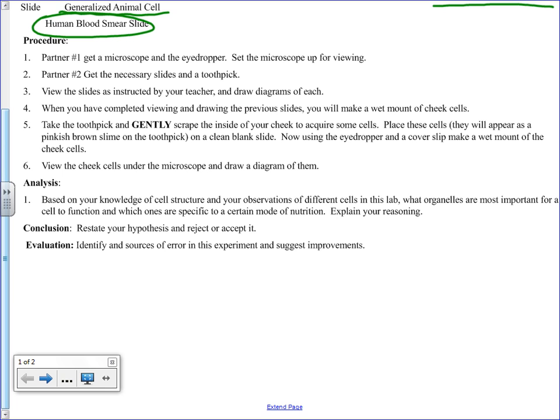If they were the same, was there a reason they all had them? That's the kind of stuff you need to talk about in the analysis part of this lab. Does everyone understand? Okay. Now, the diagrams here, the pictures.